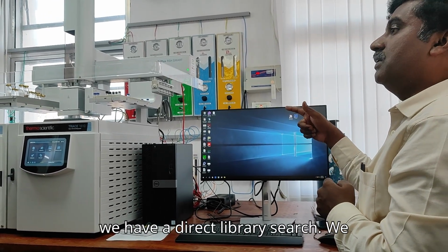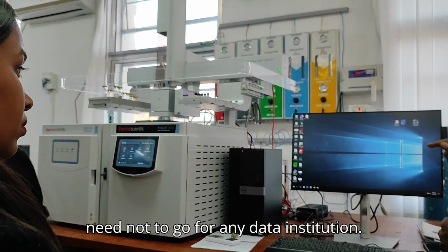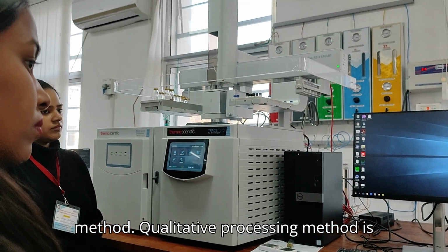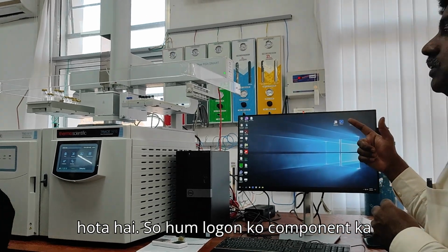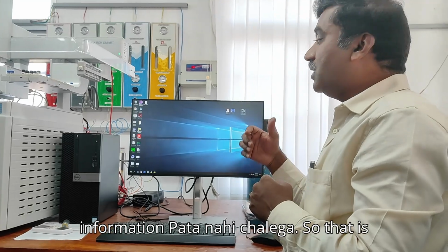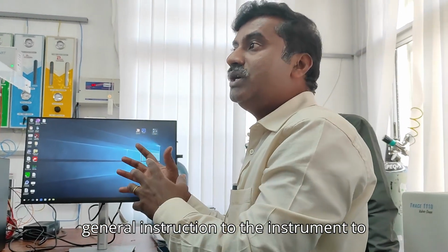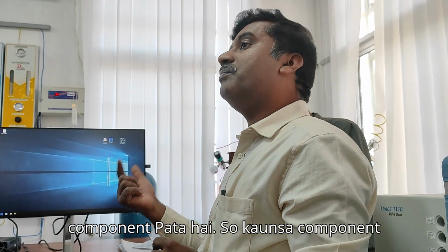For identification, we have a direct library search. We need not go for any data integration. That means a qualitative processing method. The qualitative processing method is different and the quantitative processing method is different. What happens in qualitative? We will not know the component information. That is the reason we just give a general instruction to the instrument to do the library search. But in quantitative, we know the component.